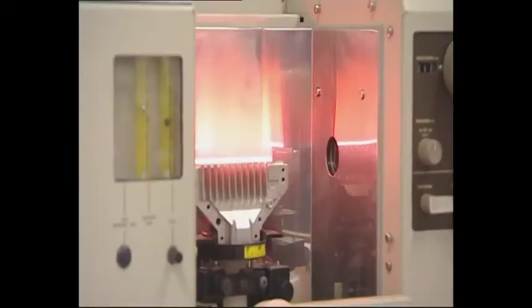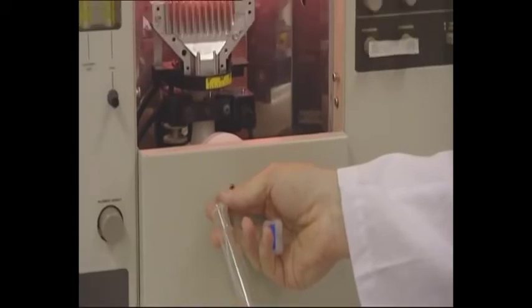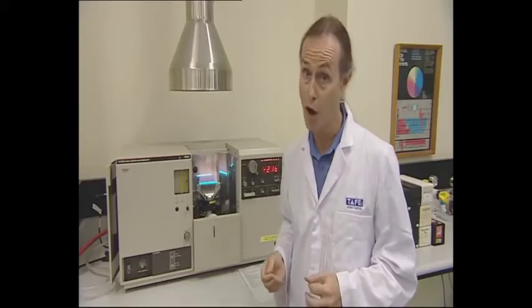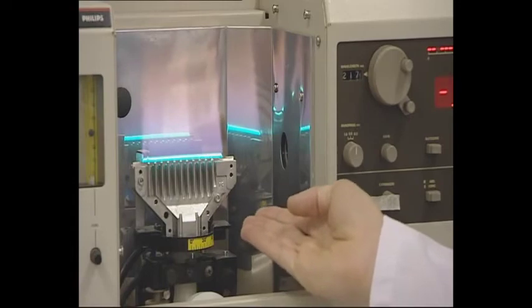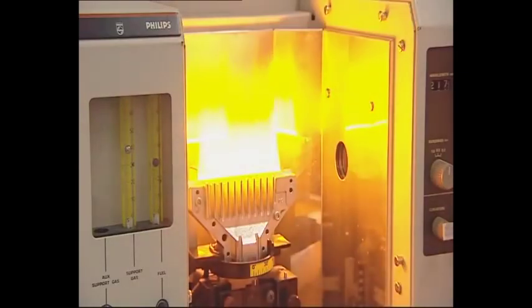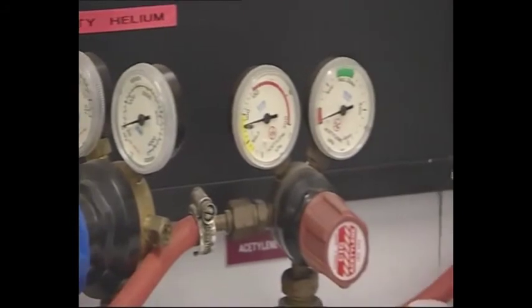You can think of the flame as the sample holder in AAS. It contains the vaporised solution where the gaseous atoms we're trying to analyse absorb light from the hollow cathode lamp. Notice that it's very wide. This allows a lot of sample atoms to contact the beam to increase the total absorbance, making the instrument more sensitive.